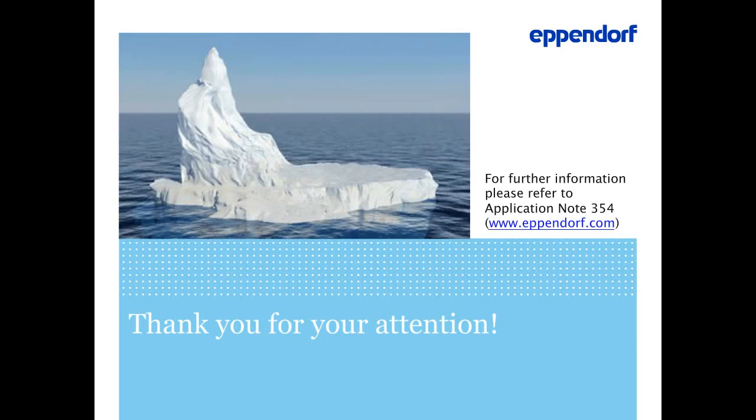Next, we have a question from Adriana, who asks, if the calibration is performed with low retention tips, how may the data change? In general, low retention tips are tips with a special surface. So the surface is modified on a molecular level, so there is no additive on it, but it's modified on the molecular level. And this leads to the fact that it is ultra-hydrophobic. And it was brought to market because so many users in the lab were working with detergent-containing liquids. And these detergent-containing liquids have the not-so-nice habit that they stick to the pipette tip surface.